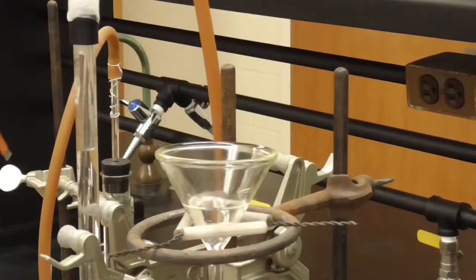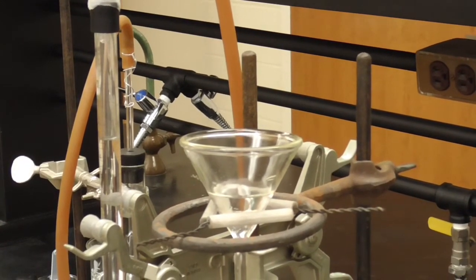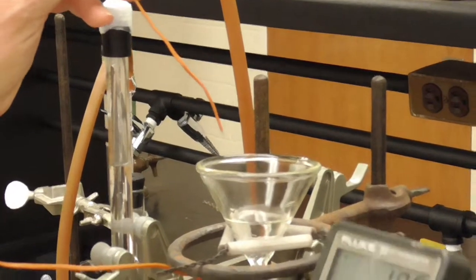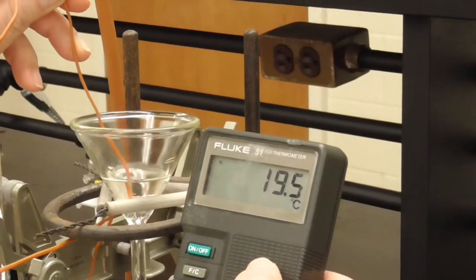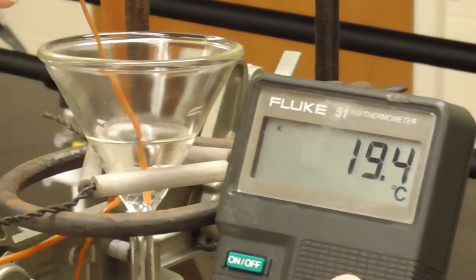Okay, we've already set up the apparatus, and in just a moment we'll use the camera to show you the entire apparatus. But if you're following along in your lab manual, Part A says to get the temperature of the water in the apparatus, so that's what I'm going to do at this point. I've got the thermometer probe in the water that's in the funnel, and you can see what the temperature is.